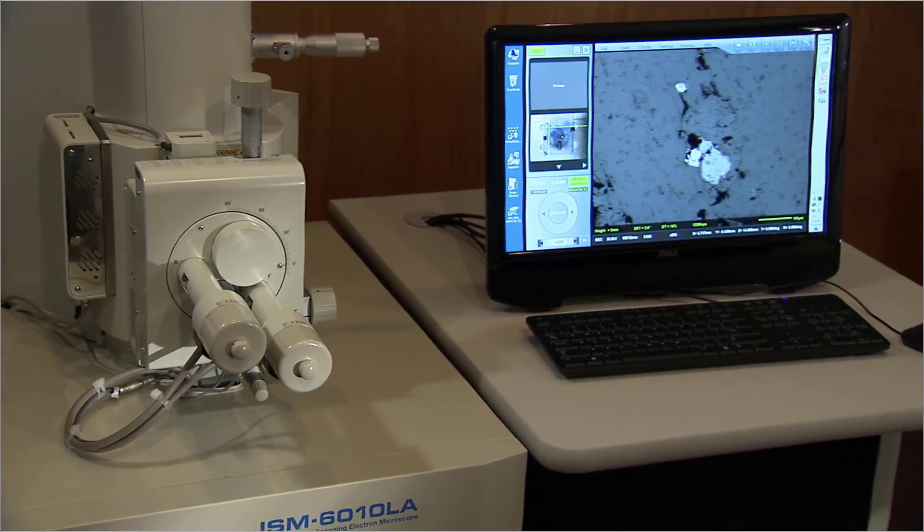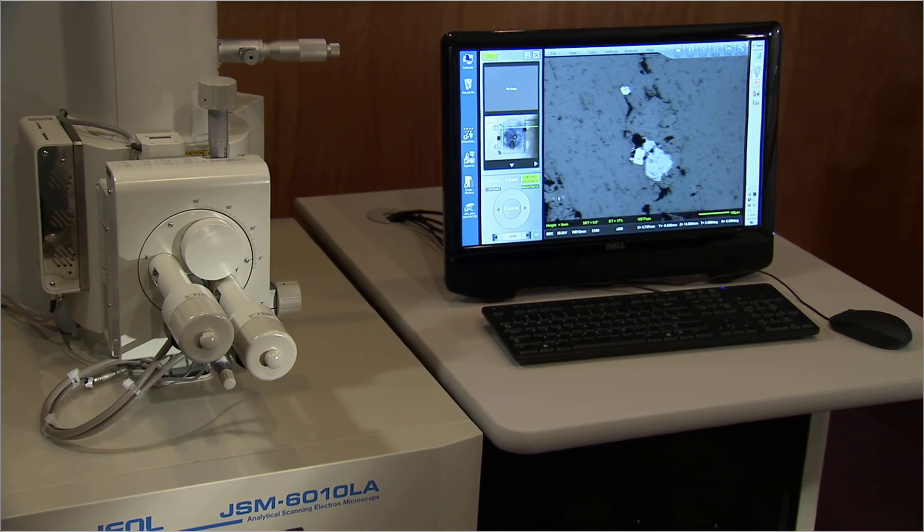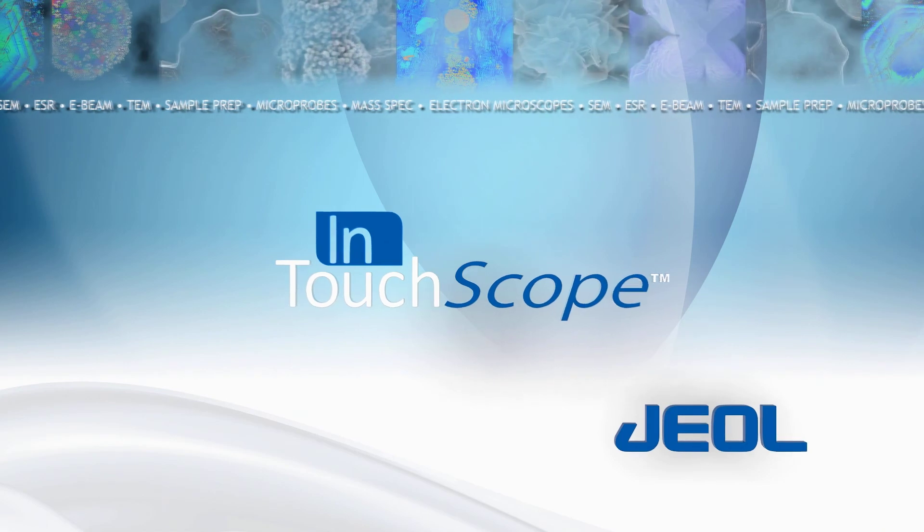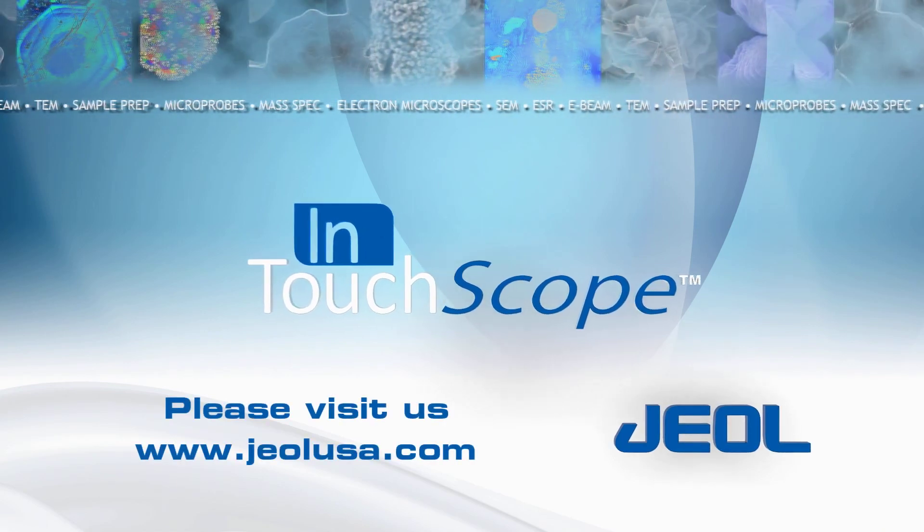This popular, versatile SEM from JEOL features all the capabilities of a full-size tungsten SEM with integrated EDS analysis in a small, ergonomic design.